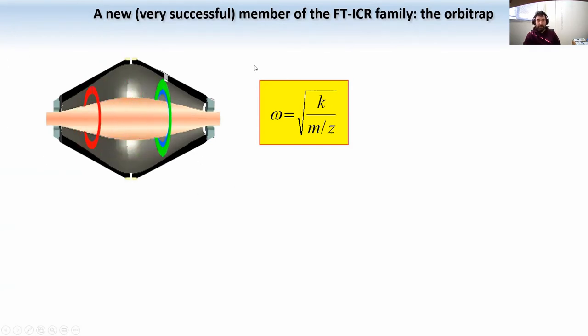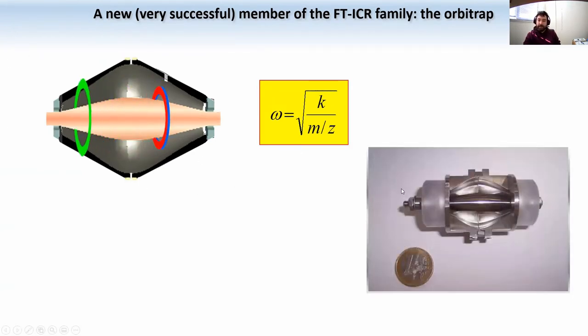This analyzer is called the Orbitrap. It is actually very compact compared to the magnetic sector that I showed you before. And it is now installed, at the moment, exclusively with only one type of vendor of mass spectrometers. But the Orbitrap is today the most widely used analyzer for proteomic experiments. Even the human proteome issue in Nature that I mentioned, all of those data were generated with mass spectrometers that had an Orbitrap as one of the mass analyzers.